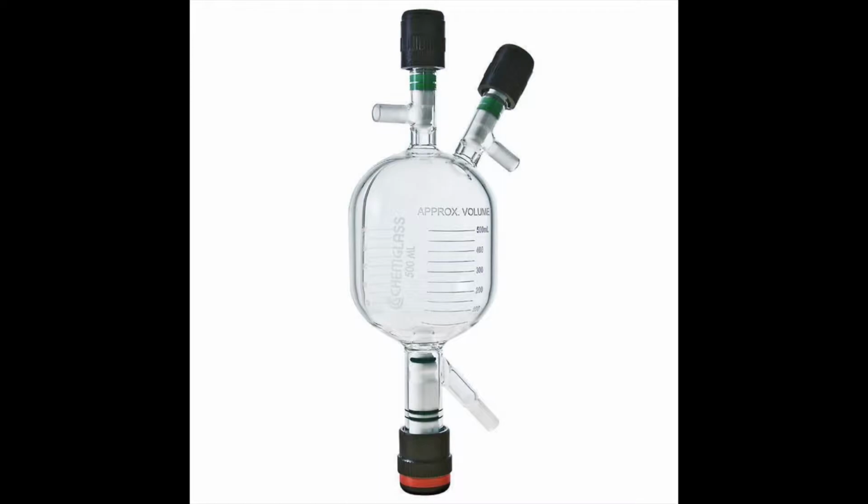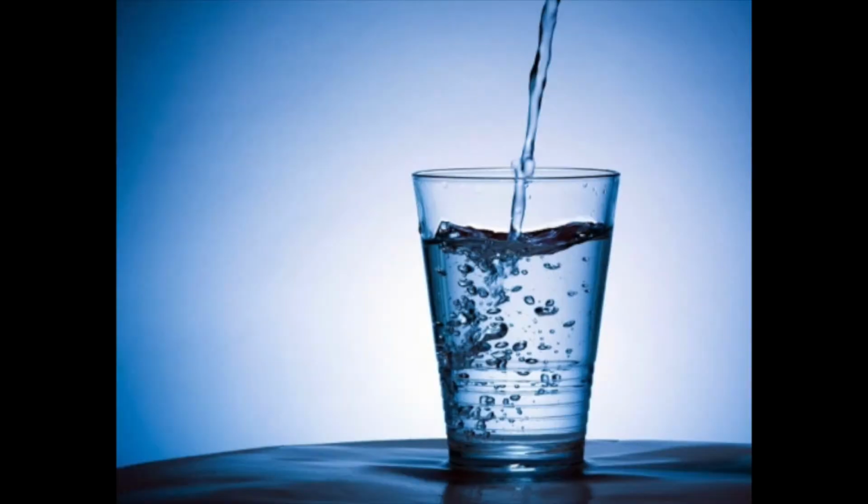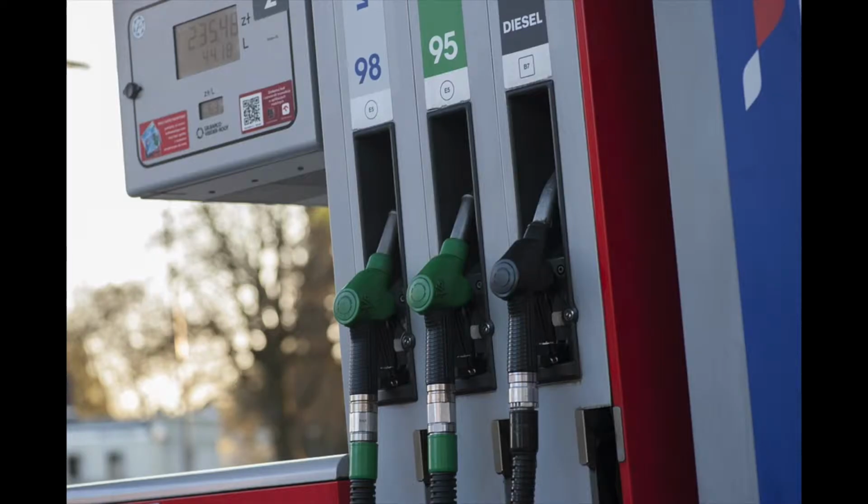This is used during distillation, a process done for separating a particular component substance from a liquid mixture by selective condensation and evaporation. Distillation can be used to purify water, make alcohols, or separate petroleum into various components that range from natural gas to gasoline to tar.